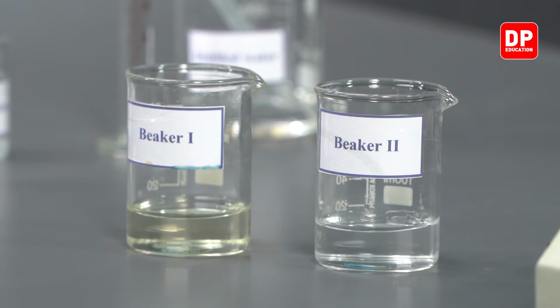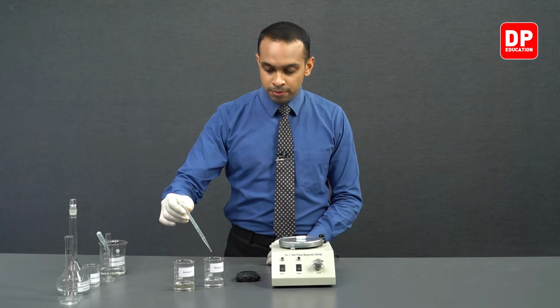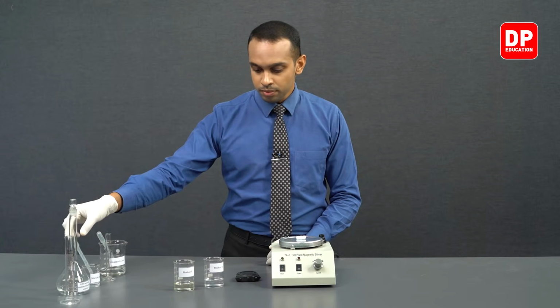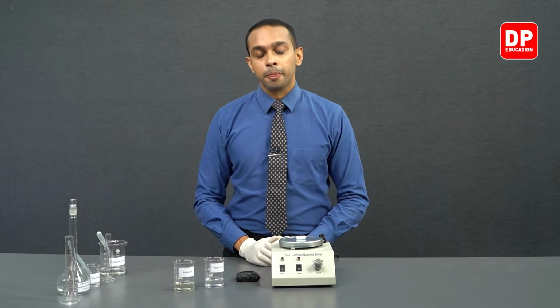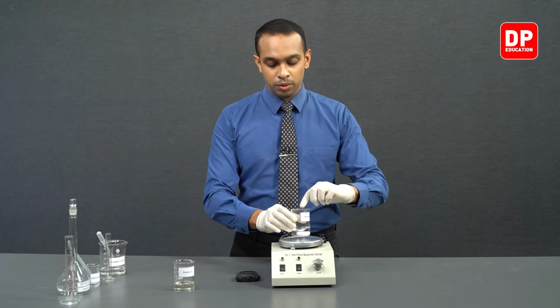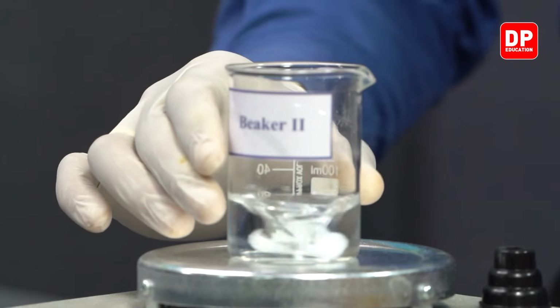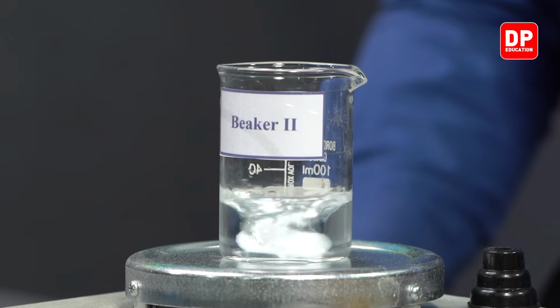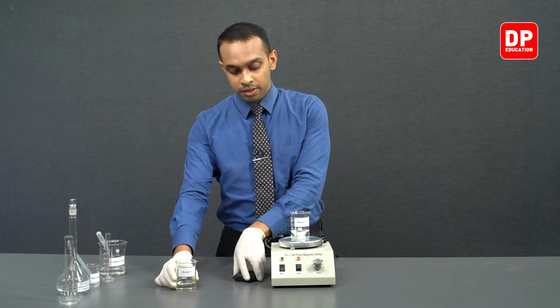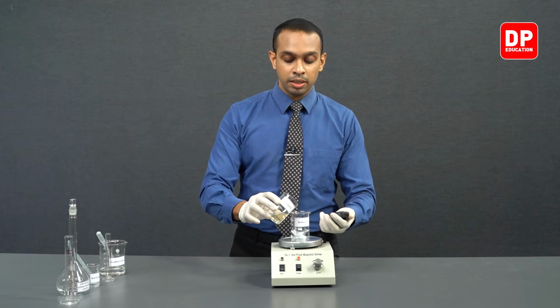Apart from that, we'll be adding 5 drops of starch solution as well. After that students, we will place this beaker 2 on the stirrer, and then we'll turn it on. And now we can move on to adding our Fe3+ ion solution, and as we add, we will be starting the stopwatch.